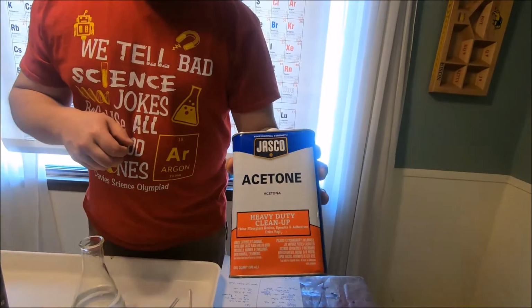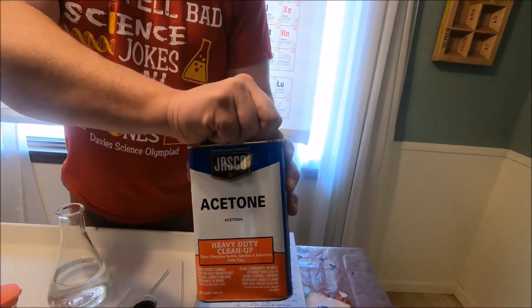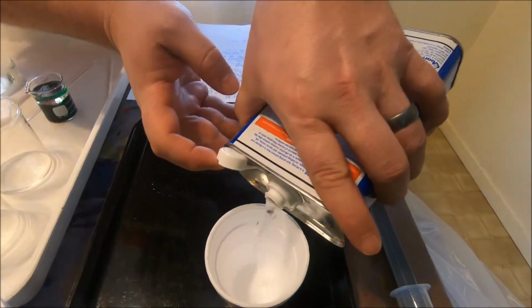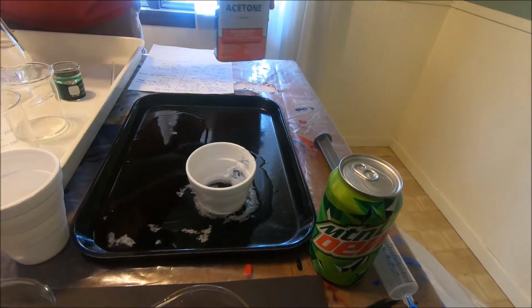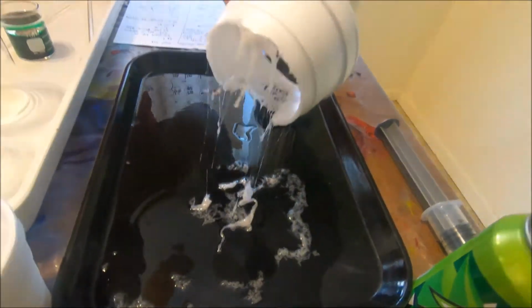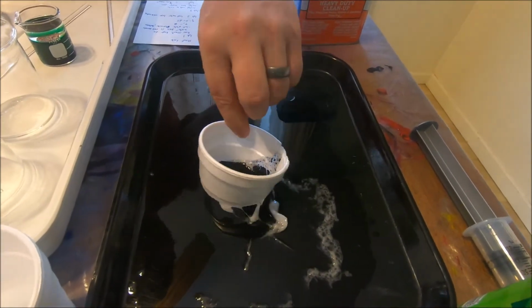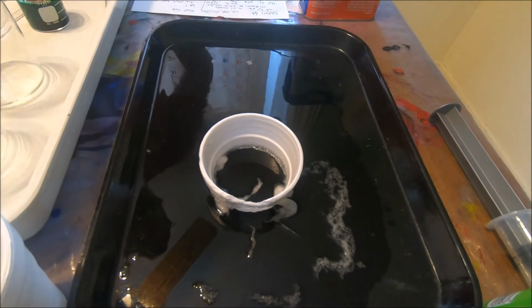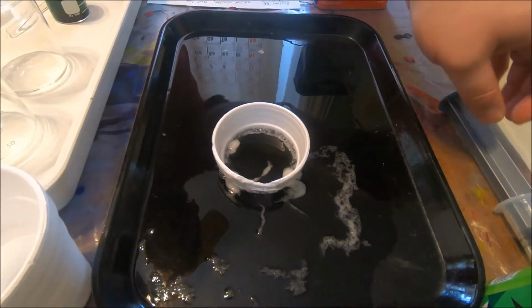The other chemical we have is acetone. Acetone is an organic solvent, so it's non-polar. What we're going to look at is if we put some of the acetone into the cup, quite a bit of a change has occurred. We can see that the acetone has dissolved and broken down that cup. So you wouldn't want to use a styrofoam cup for holding acetone. The organic solvent is able to dissolve it.